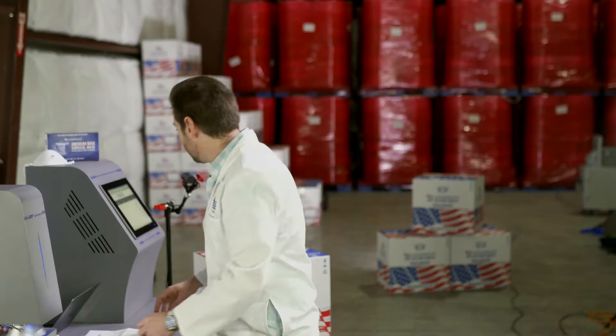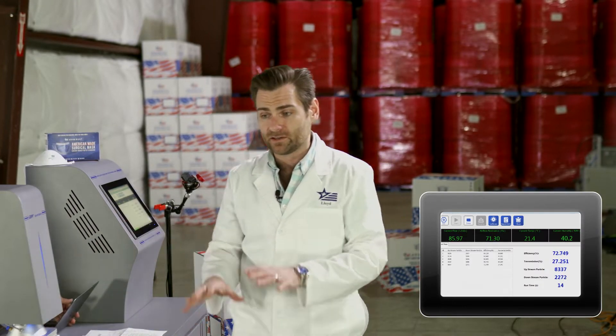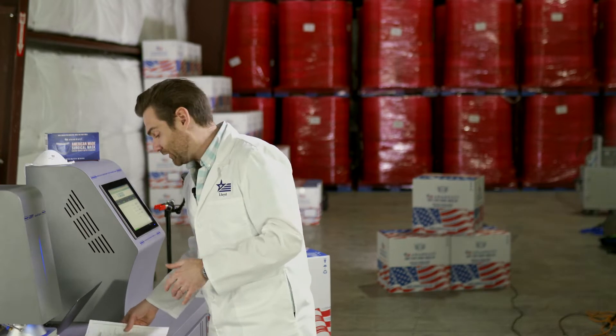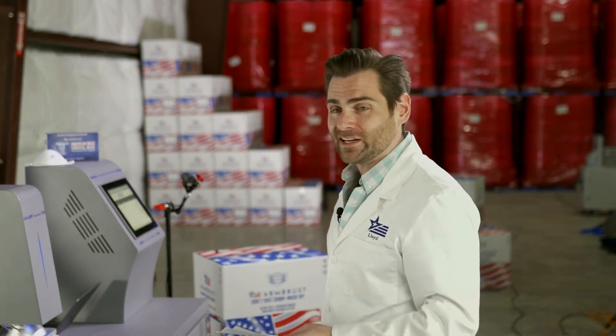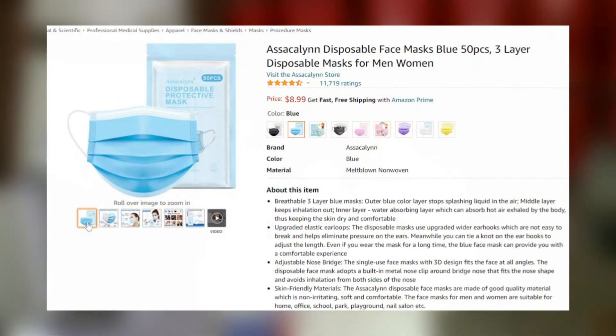Thank you Rossio for helping. Rossio is our head of finance, so he's here to make sure that somehow this makes sense for us. Okay, this is a PFE machine. We are testing particulate filtration, but I'm also going to give you my other opinions on this mask because it takes a couple minutes to run and I'm here, so that's what I do.